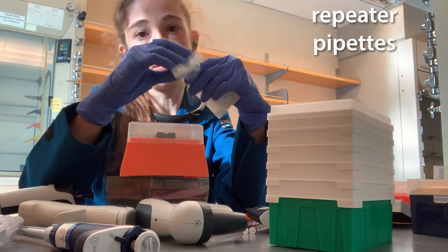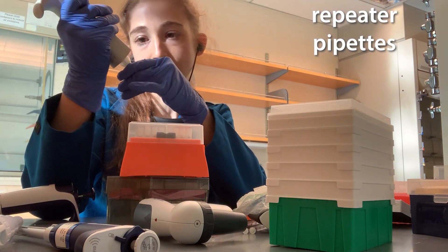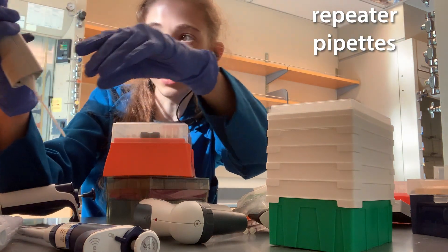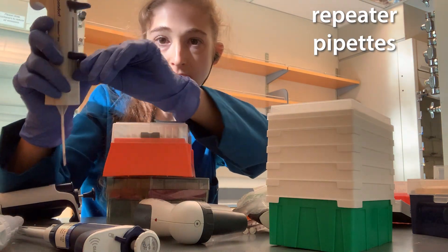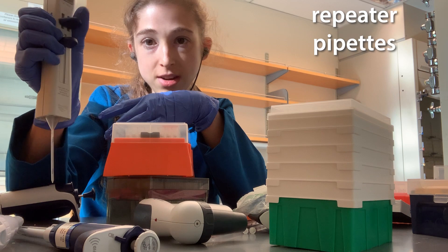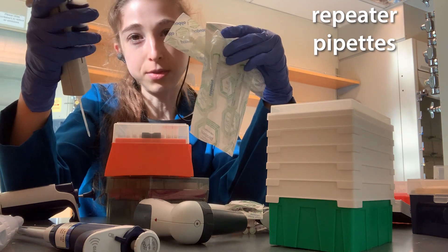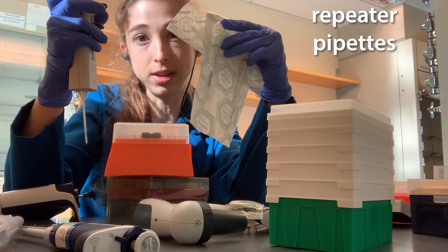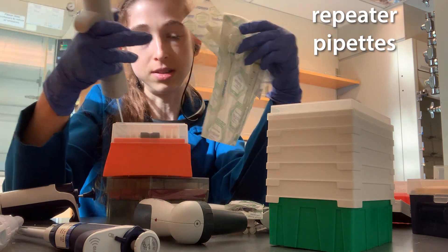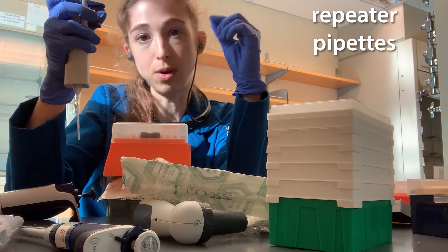The repeater pipette is super useful. Basically, they come in different sizes, and you snap the tip on, push this down, and you can change the step size and number of steps. Before you start, you pull it all the way up and squirt a little bit at the beginning — that first one won't be a full sample. Then each time you push down it gives the set volume. For smaller sizes you can go by one or two microliters, but with bigger sizes you can only go by 10, 20, or 30. The tip size determines what step increments you can actually do.